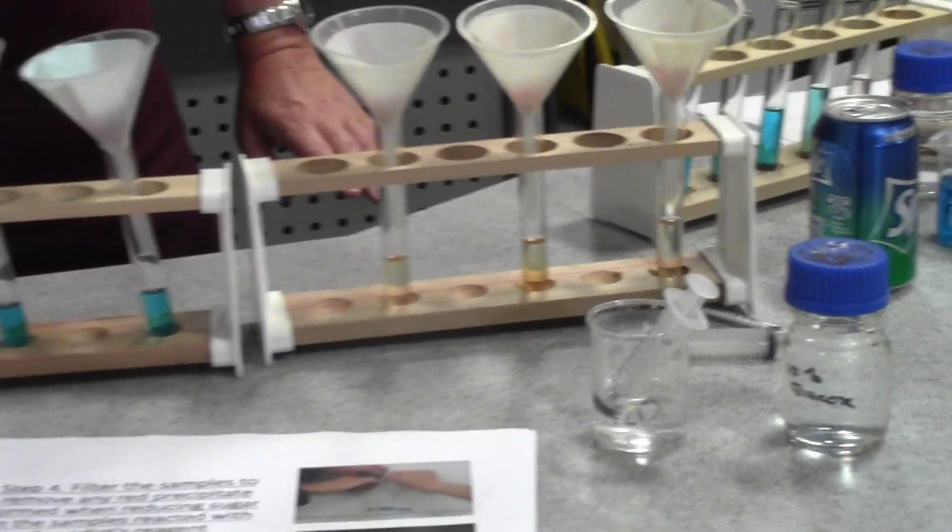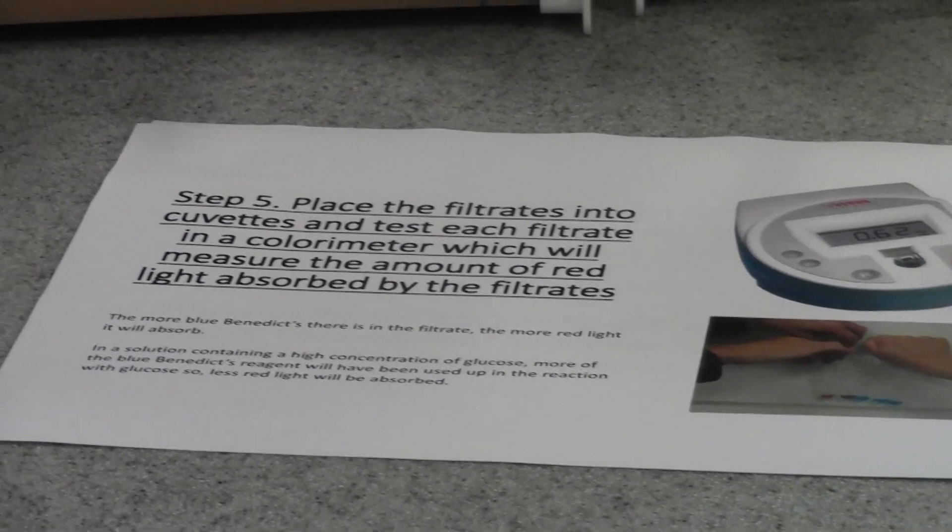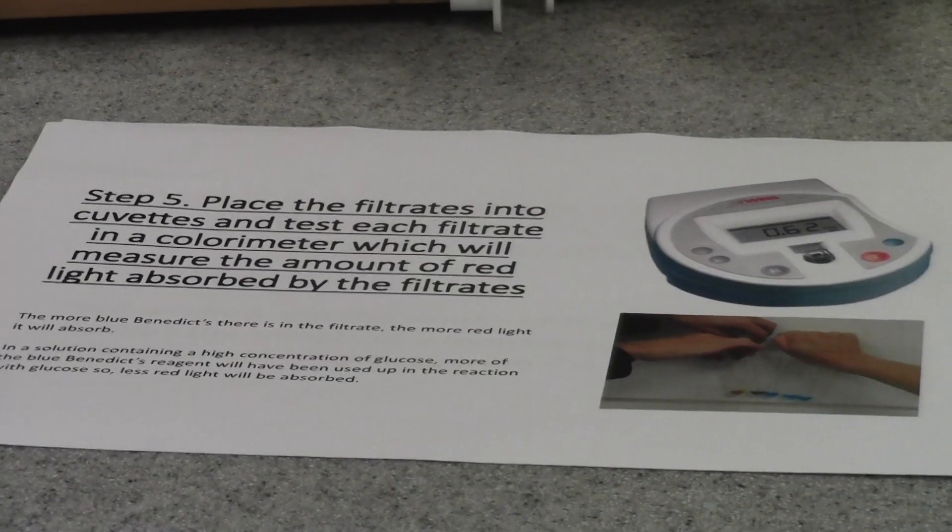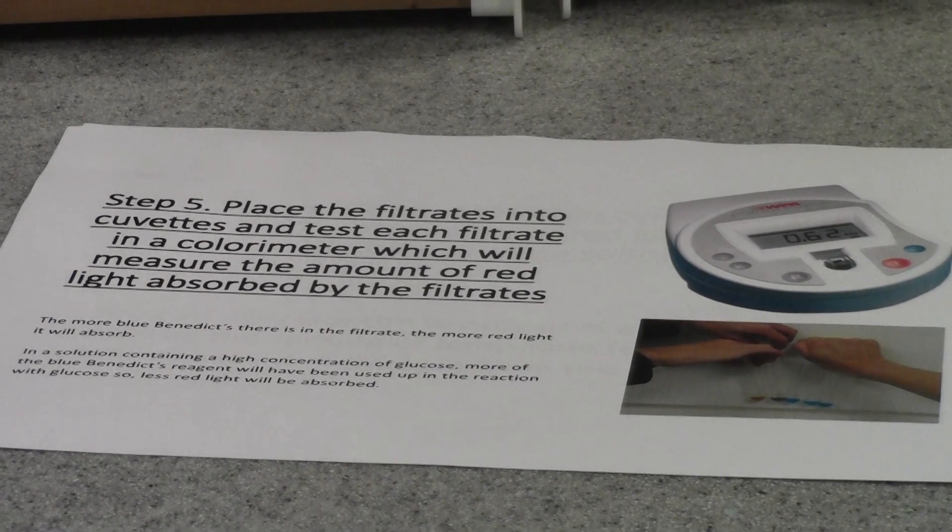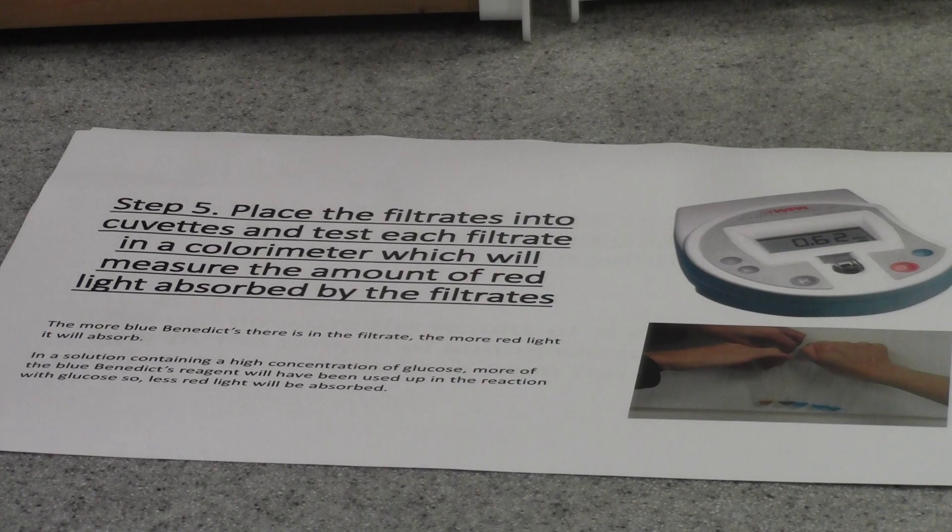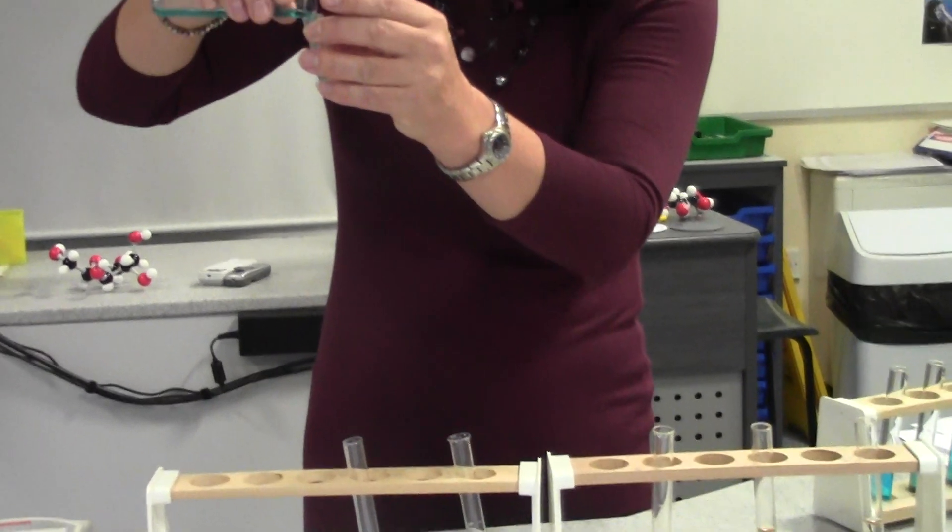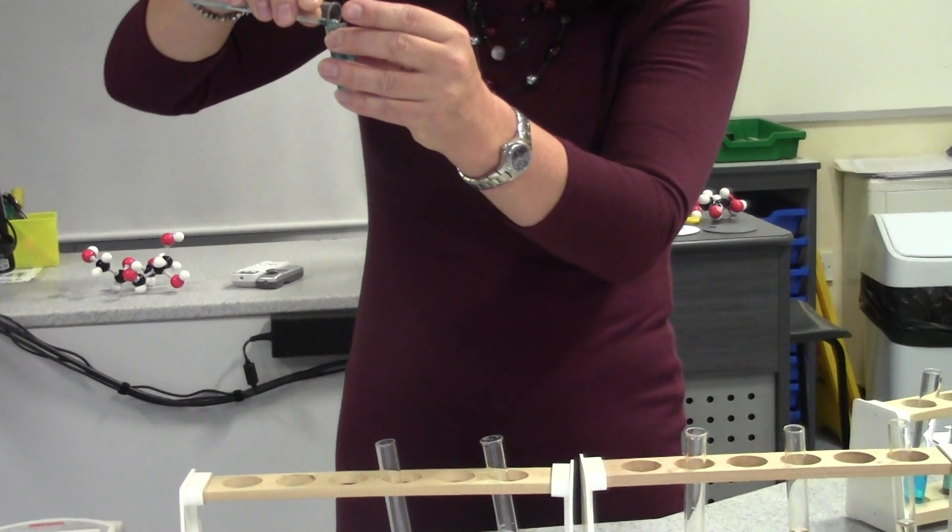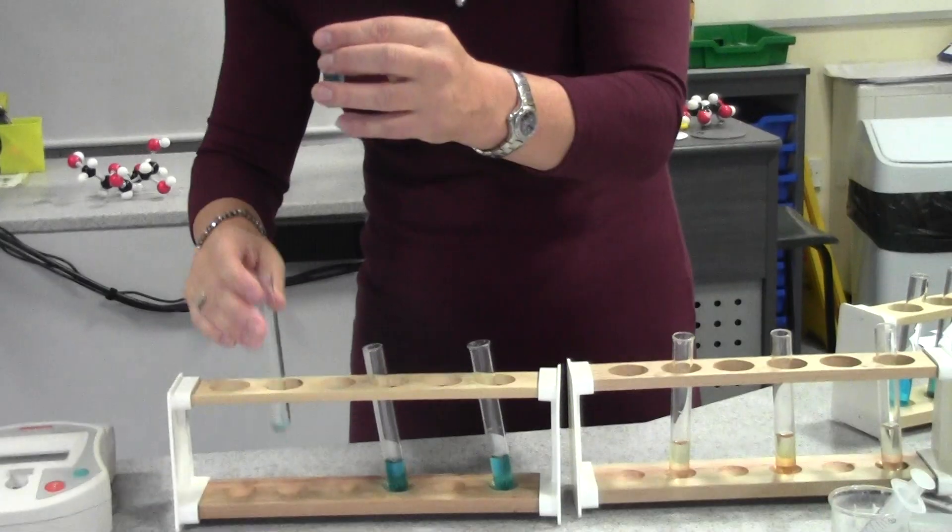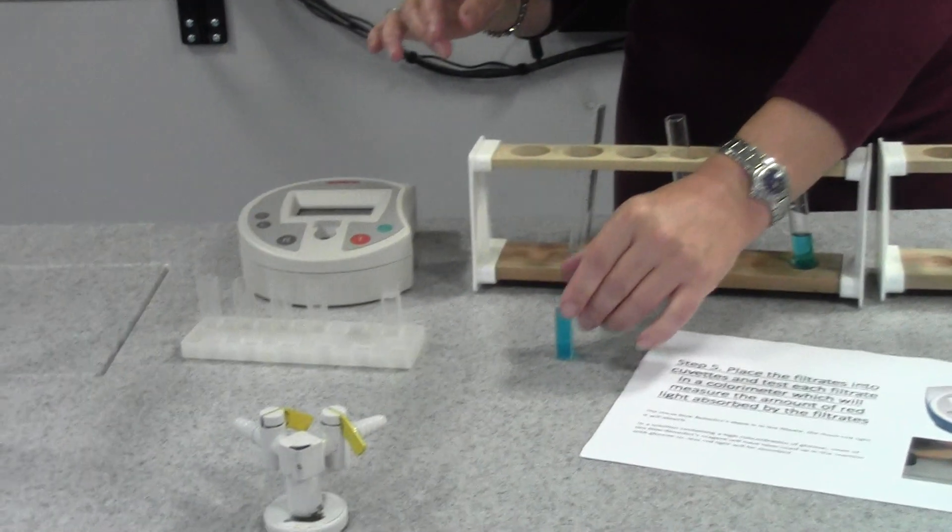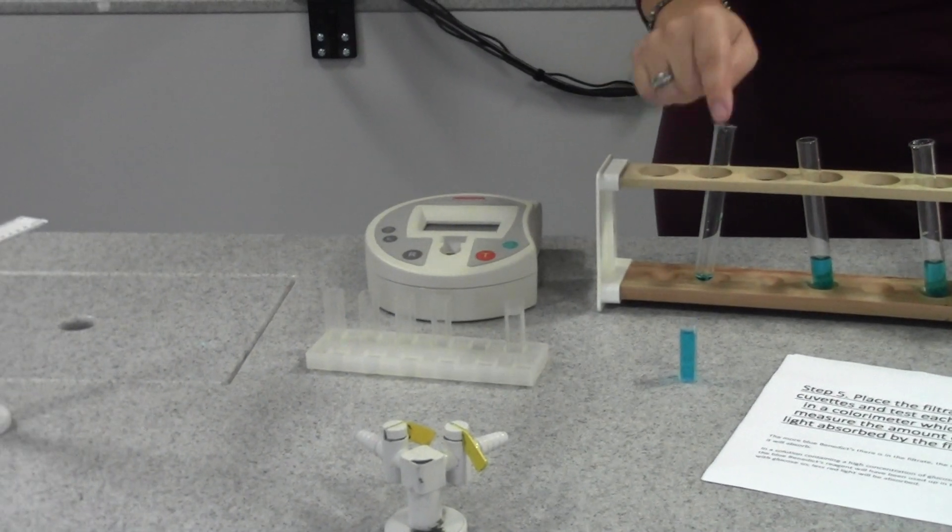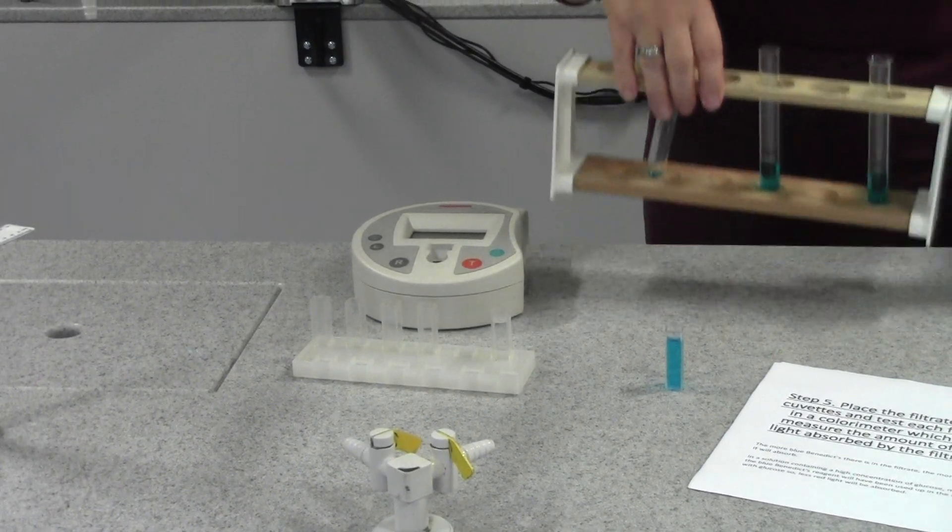The next step is that we're actually going to take these solutions—so if I remove the filter funnels there—and we're going to place them in these small plastic vials which are called cuvettes. So I'm going to fill a cuvette with my first solution, the filtrate. I'm going to use a device called a colorimeter now to measure how blue that is, so let me move these out of the way and show you the colorimeter.